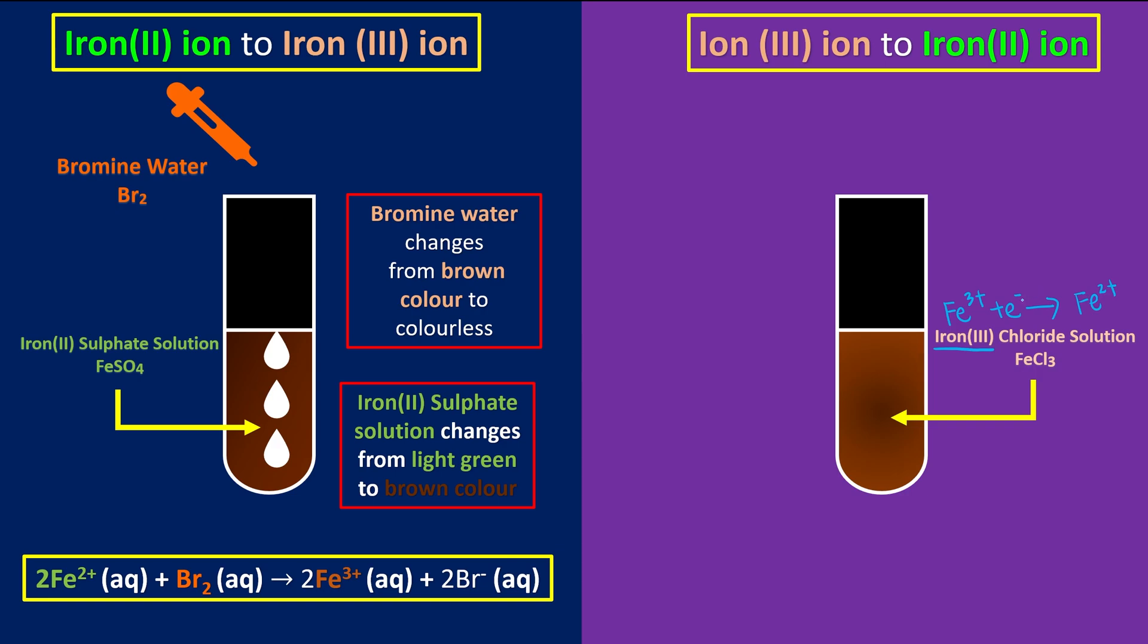So receiving electrons means reduction process. So of course, we need a reducing agent. So today, we're going to use zinc powder, and of course, you can use any other reducing agent. And we're going to add in our zinc powder slowly, and we're going to observe the changes.